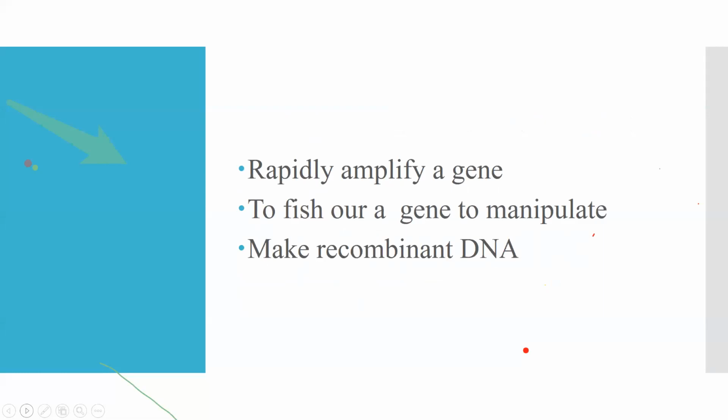For cloning, you have to use restriction enzymes, cut and paste DNA, then allow it to grow inside a bacteria. It is almost like a week-long process. But a technology such as PCR is basically doing what cloning does, but very rapidly. How does it do it? Here you amplify the DNA by using a specific set of primers and buffers and salts and enzymes.